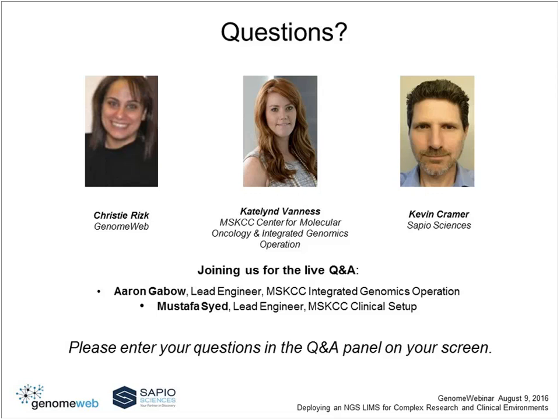Caitlin or Mustafa or Aaron, can you tell us how many people in the MSKCC lab are using Exemplar and tablets, and whether you see that number increasing in the future? Well, right now it's 0 because that is a feature that is with 8.0 and we're still on 7.1. We are looking to switch over to 8.0 for the tablet usage, and then that would probably be most of the technicians.